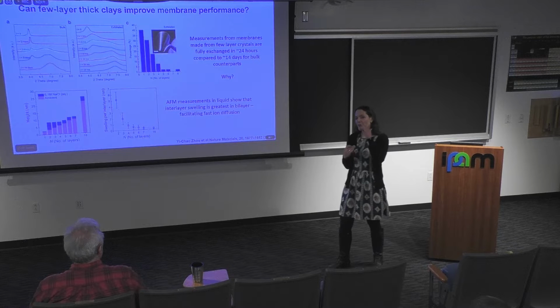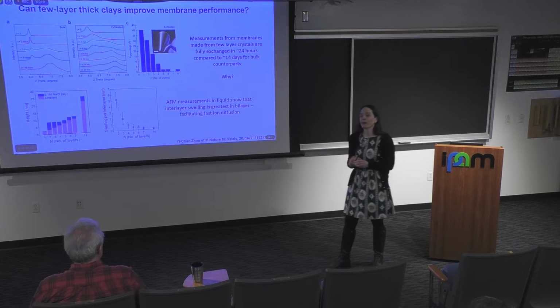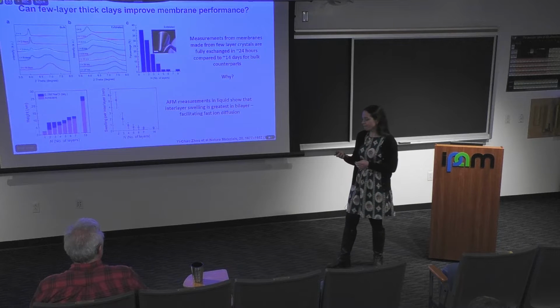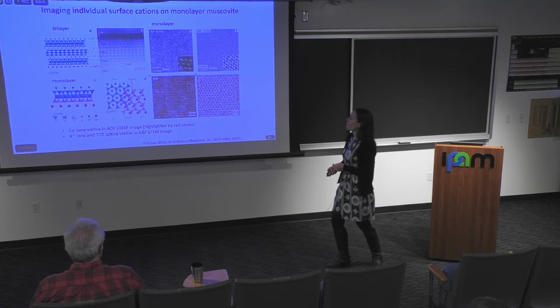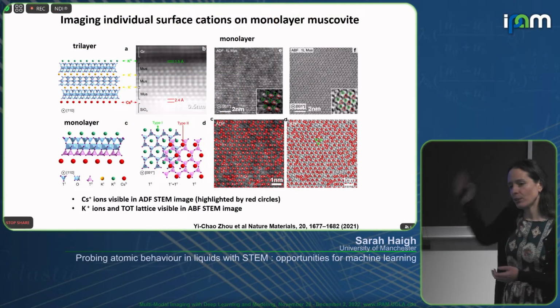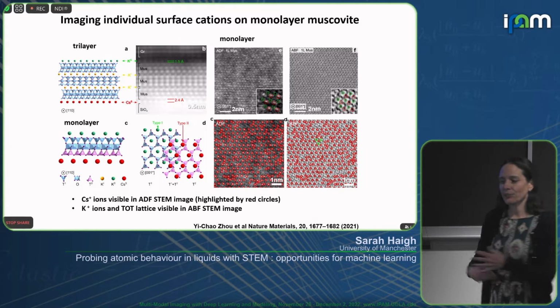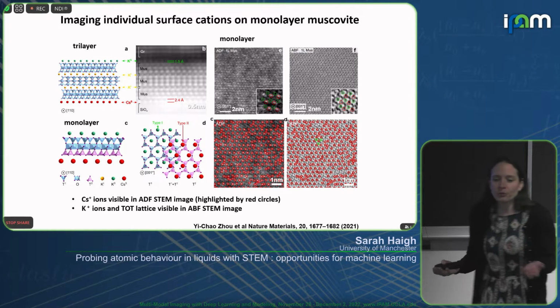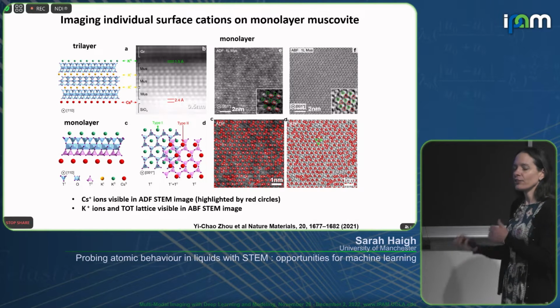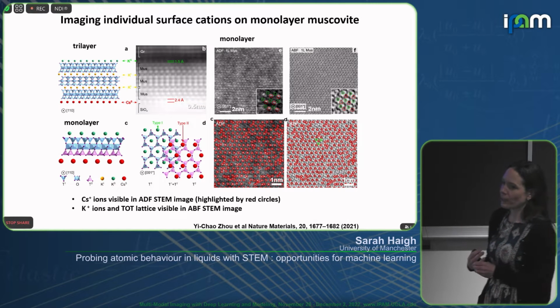So when you have a space of 5 nanometers, the ions that are diffusing into that space have the same speed as they would diffusing through free water. You can also now look at these materials and understand the surface ions, because we saw this swelling of the interlayer space, but when you make a material just a few layers thick, then most of it isn't interlayer anymore. Most of the positions that the ions can exchange onto is actually the upper and lower surface, and this is a real challenge for electron microscopy.